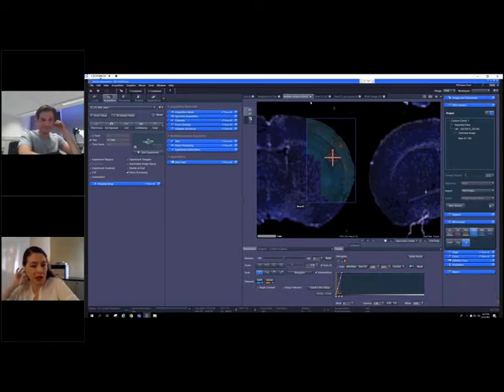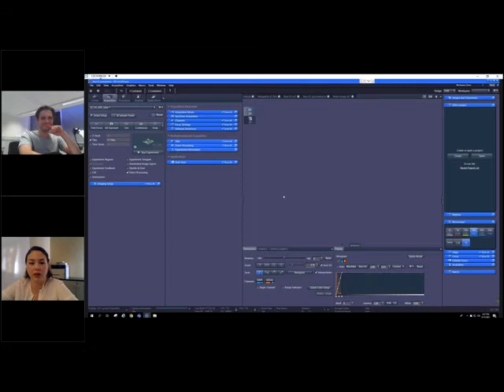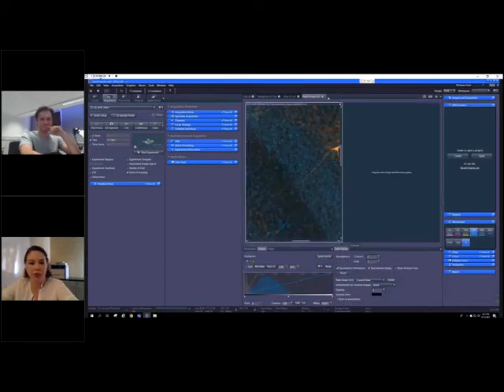Thank you, Frank. That is pretty amazing. I think if I had this in lab, it would have saved me a lot of time when I was still doing research. Like many of my customers and our customers, we pack a bunch of tissue onto one slide. And then you spend a lot of time focusing and finding and cataloging what image went where. So especially I think Zen Connect is very handy to keep all the data straight. I think everybody is probably wondering, how does this work for multi-well plates?